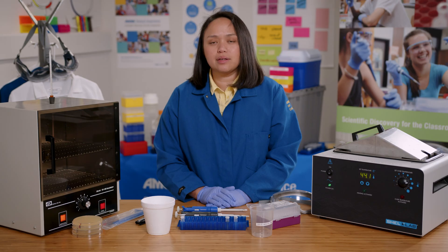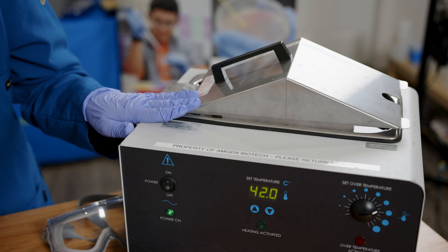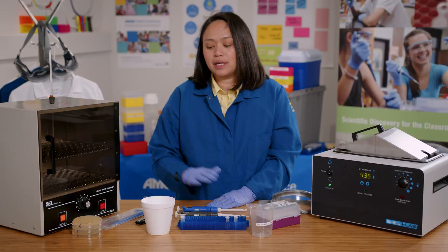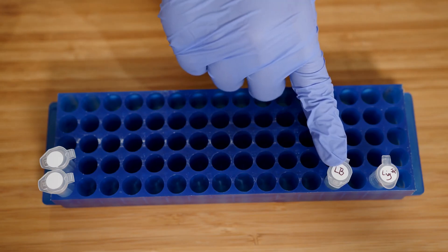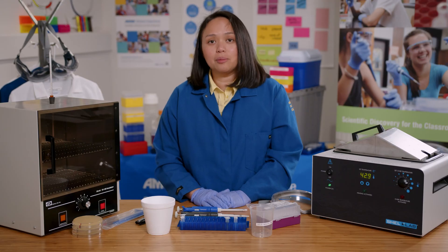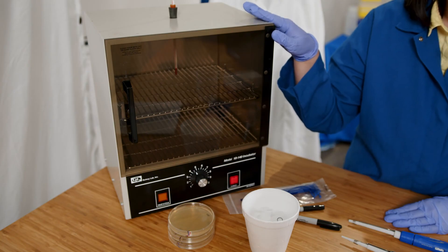Keeping the E. coli cells as cold as possible helps to keep them open to accept the plasmid. Then I'll use the water bath to heat shock the cells, which causes the adhesion zones — gaps in the cell wall — to close and trap the plasmid in the bacteria. After the heat shock, I will put everything back on ice. I'll then add LB, or Luria broth, which provides the cells with nutrients and allows them to grow. Finally, I'll plate the cells on LB plates to grow overnight in the incubator.